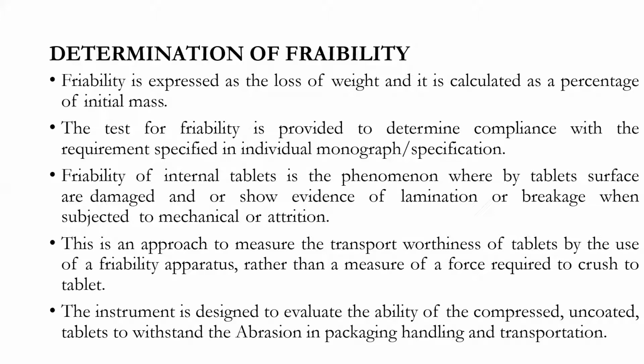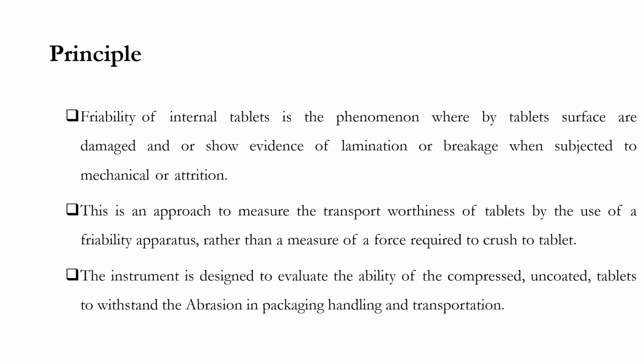The test of friability is provided to determine compliance with the requirement specified in the STP or individual monograph. Friability of uncoated tablets is the phenomenon whereby tablet surfaces are damaged or show evidence of lamination or breakage when subjected to mechanical shock or attrition. The instrument is designed to evaluate the ability of compressed uncoated tablets to withstand abrasion in packaging, handling, and during transportation.